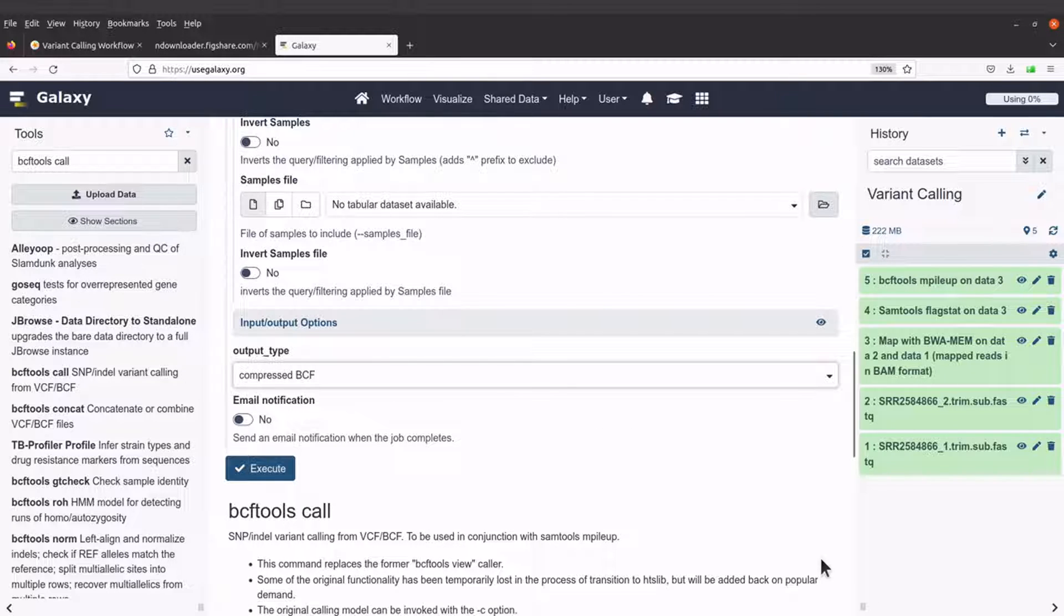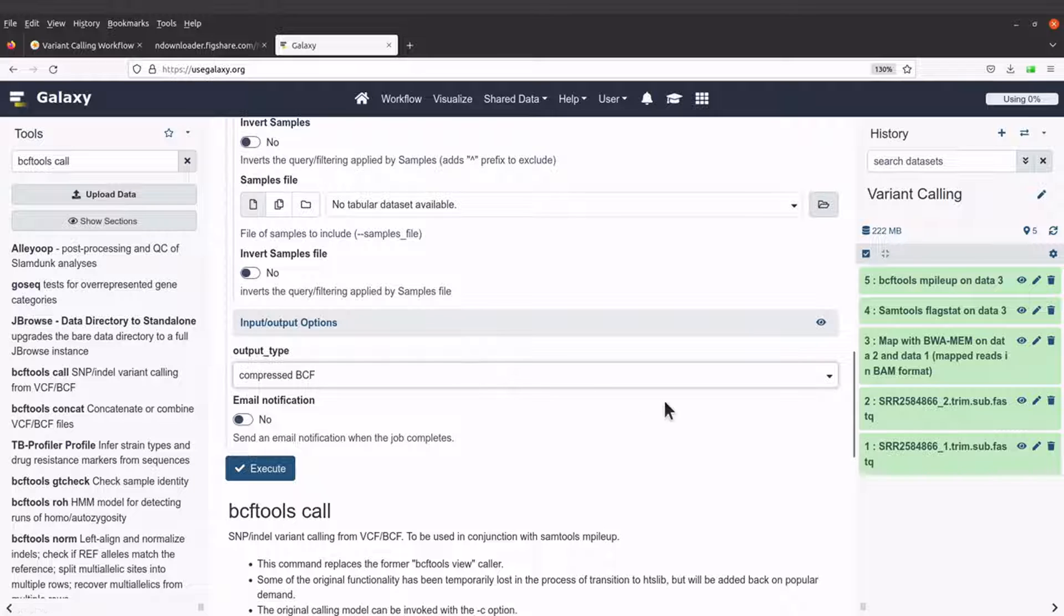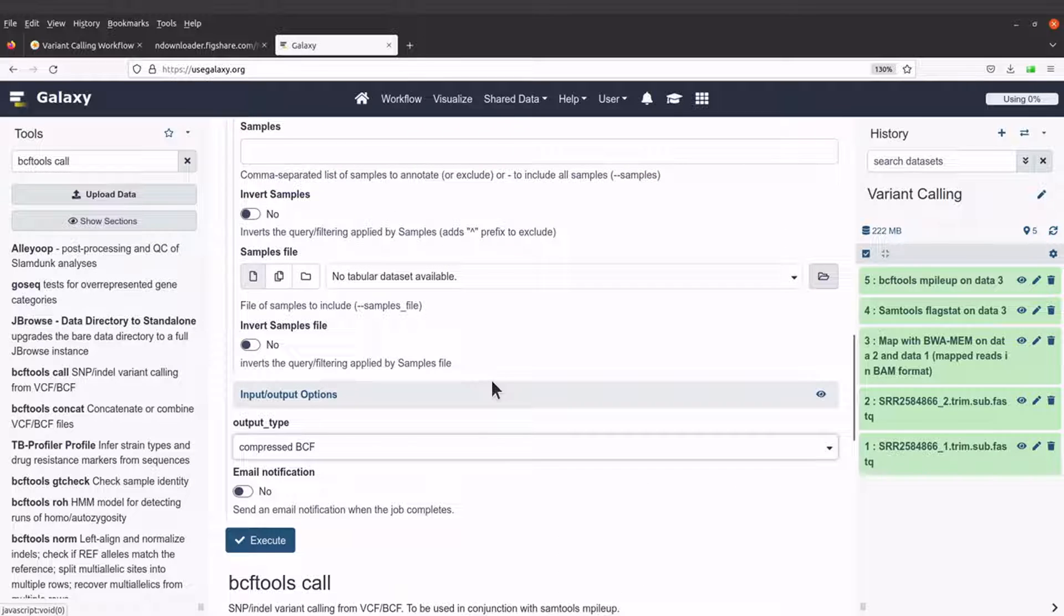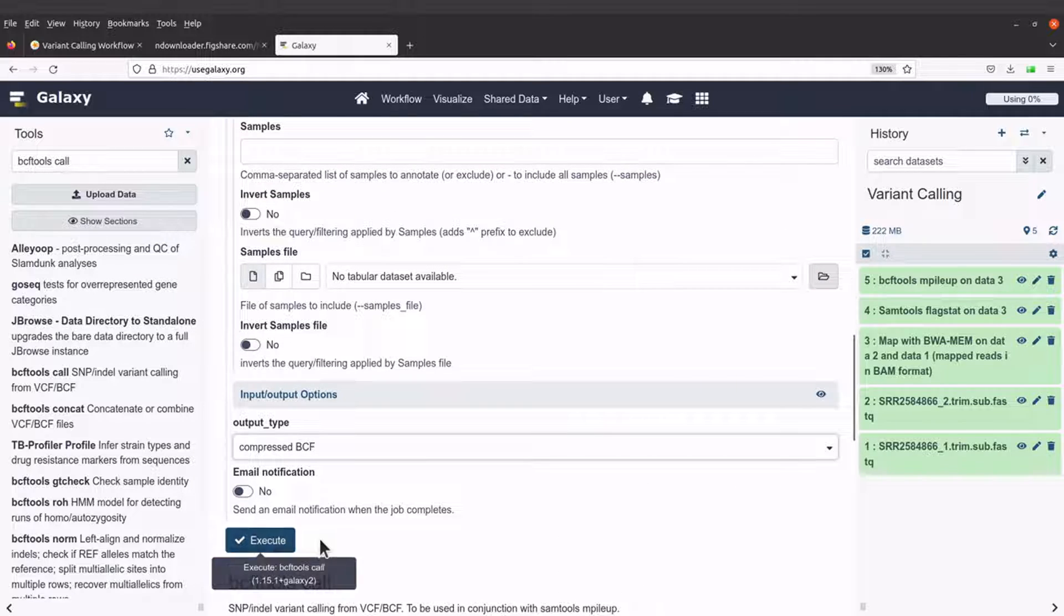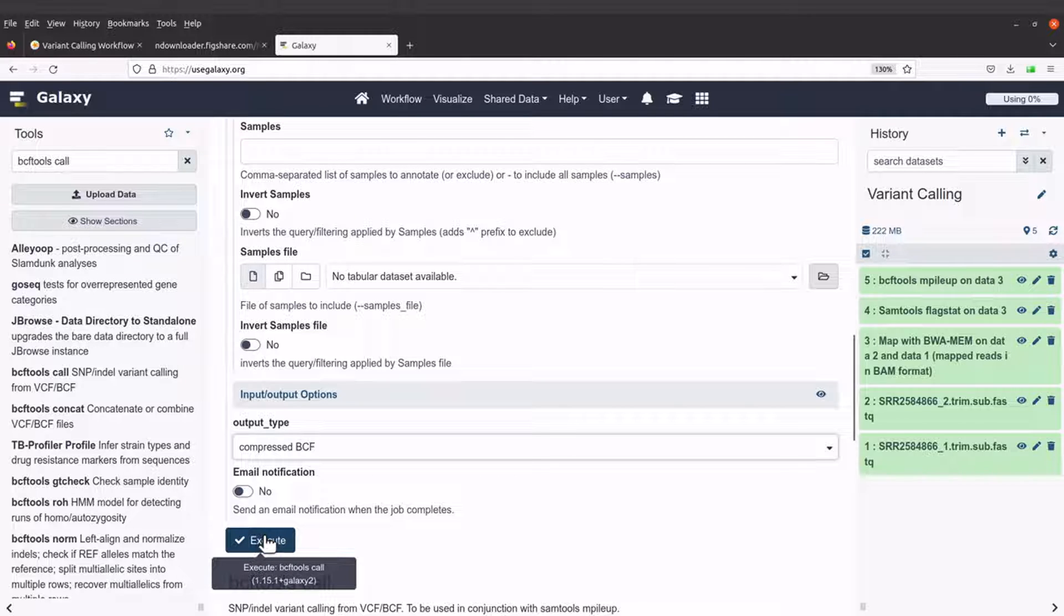For this tutorial, I would like us to use the compressed BCF format. So that's about it. So let's run this command. We will click on the execute button here.